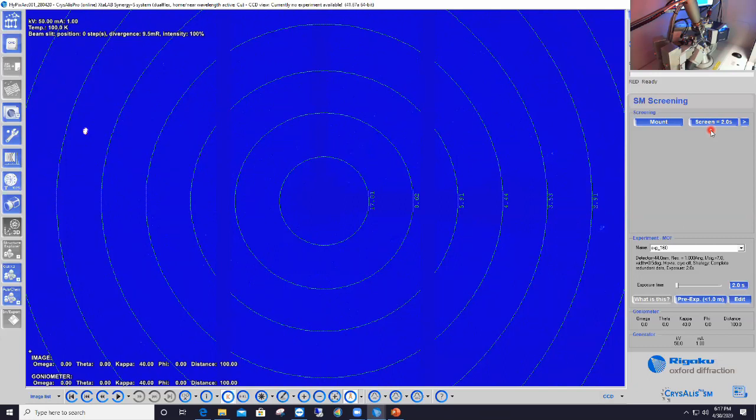Looking at these preliminary results, if you deem your crystal good enough, then you jump to the next step, which is the proper and fancier screening that is called pre-experiment. Pre-experiment will collect data in several crystal orientations. Because we collect data in different crystal orientations, the indexing will be better and more accurate, and therefore the strategy calculated from that better indexing will itself be better. So let's first take that quick X-ray snapshot and screen the crystal.